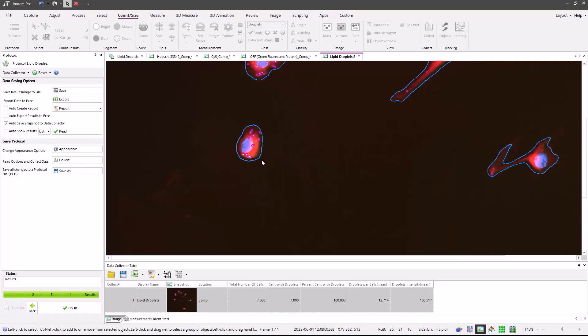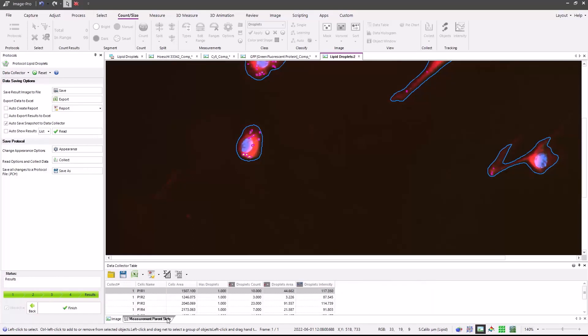From a data analysis standpoint, we have a summary table reporting the number of cells, cells with droplets, the average number of droplets per cell. In addition, we have the per cell data, which gives us cell area, whether it has droplets or not, how many droplets in each cell, droplet area, and the intensity of each of the individual droplets from the GFP channel.